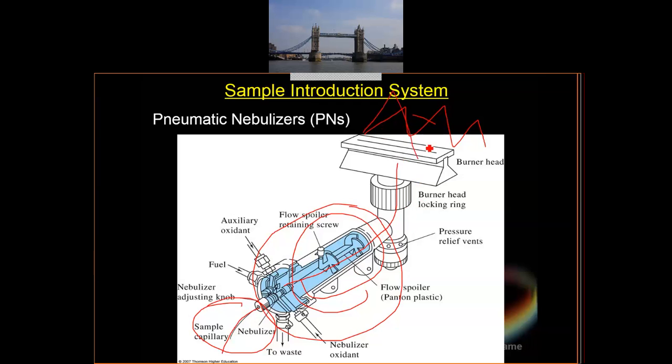But here, it will be burned. There will be a small opening here, a small opening. I think the size of an A4 paper. Not the thickness of the A4 paper, I think the size, very thin.